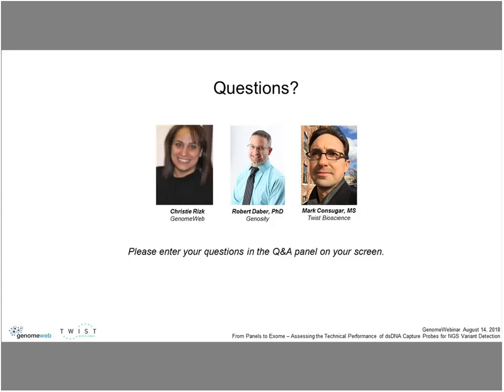All right, great. Thank you so much. Oh, sorry, please go ahead. Yeah, I do know that on-target in general is a stat that a lot of us like to hang our hat on. But the one comment I would like to make is that at the end of the day, uniformity is where that slight loss in on-target is going to be well recouped on the back end, when you're seeing uniformities that allow for that kind of coverage.